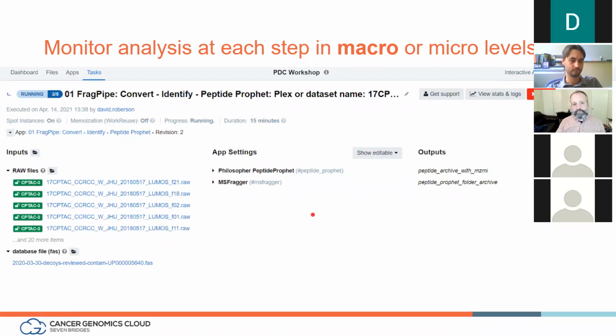So there's a tremendous number of default app settings that Felipe has coded, so you can expand these and monitor those. You get to see the duration, and also how much of the cloud credits were used. By the way, we're all going to be using a training cloud for today. We're all going to be using a training billing group that Sai set up for us.